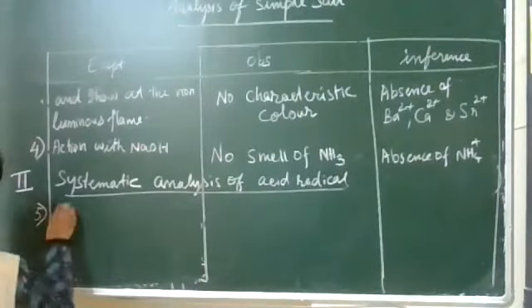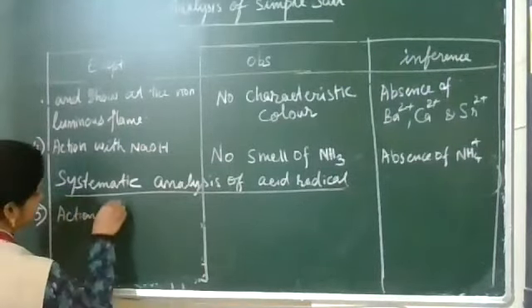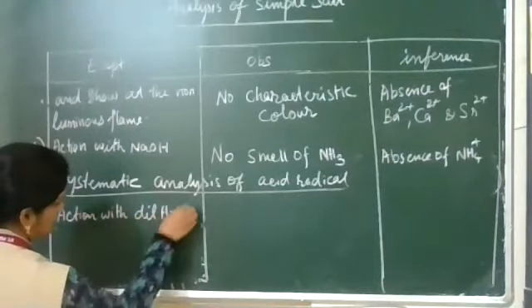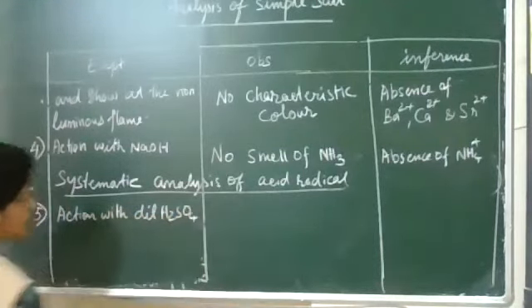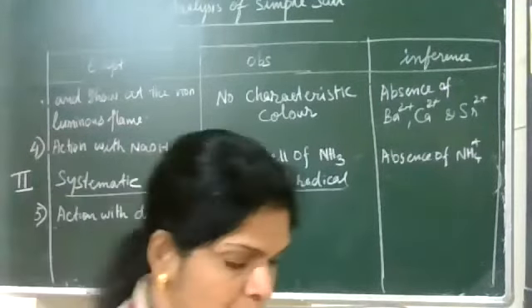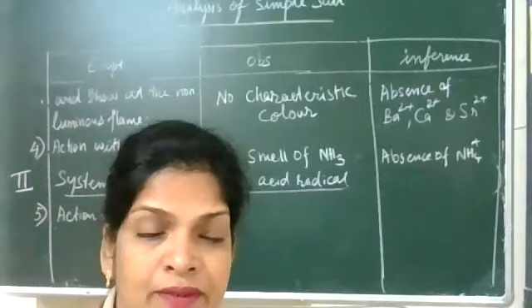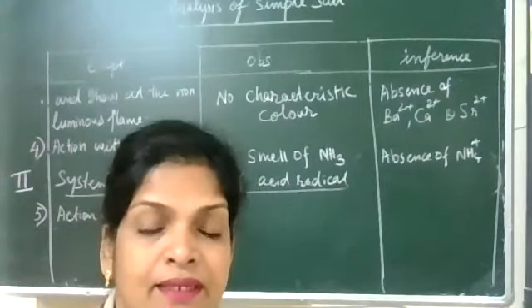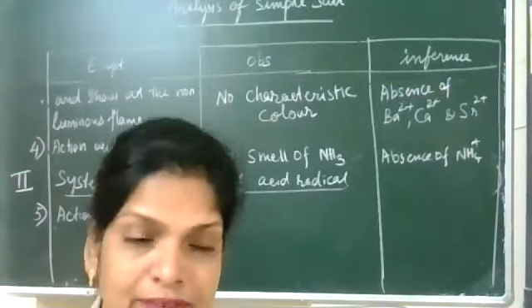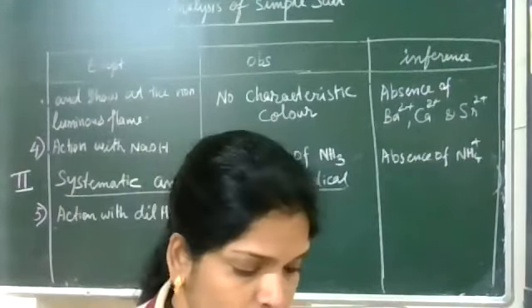Number 5, action with dilute H2SO4. So what you are doing, you are simply taking a little bit of salt and adding dilute H2SO4.